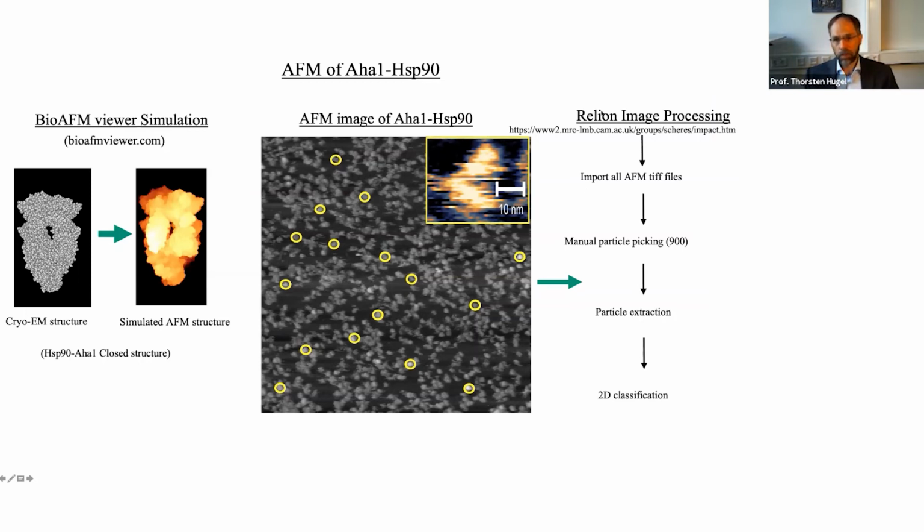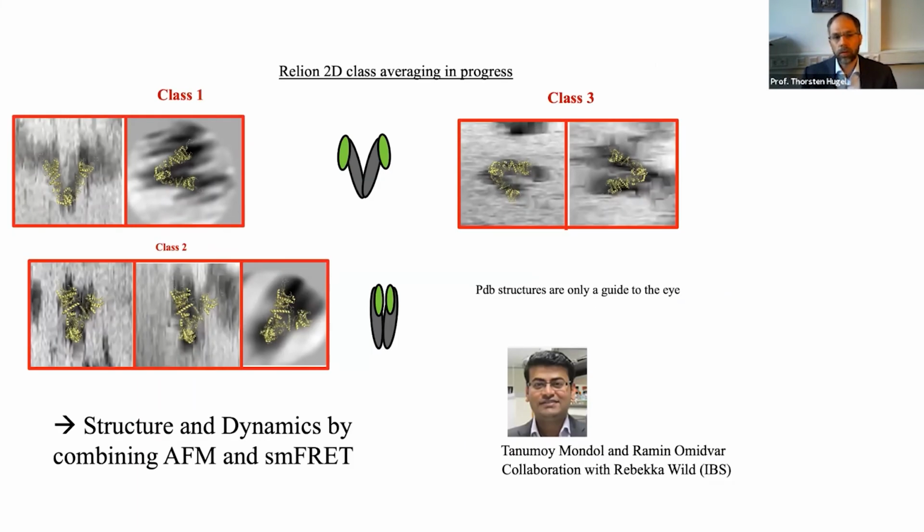And maybe here is a good point to mention this. This tool is based on Bayesian analysis, kind of maximum likelihood. And this will be interesting because there are more and more tools also coming out that use deep learning, and actually some that don't even use data anymore. They just do data mining. And it will be really interesting. I think at the moment we should follow both paths, and then we will see what finally is better. I think both will have their advantages and disadvantages.